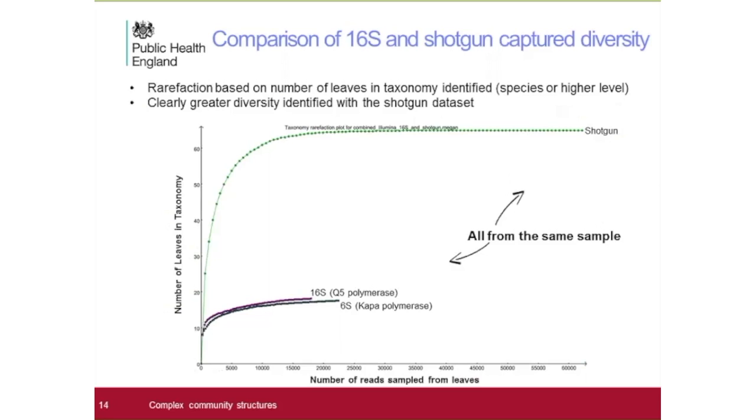Comparing our results, this is the number of the taxonomical entities that we have been able to resolve and the number of reads using 16S libraries versus shotgun libraries. And what we did in shotgun is sequence the whole sample and extract out of that the 16S comparable taxonomical data plus any unique gene sequence that are associated with certain taxa, species, or genera.